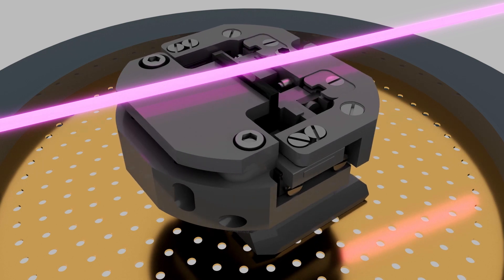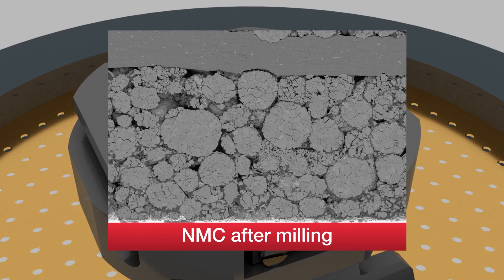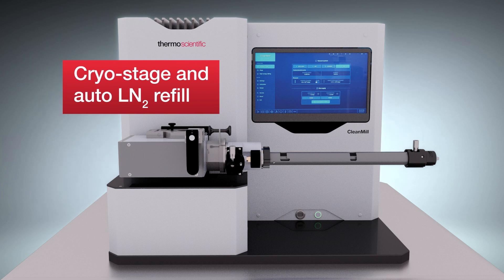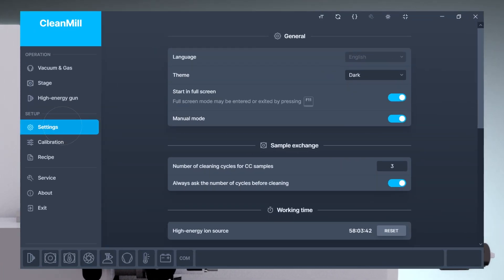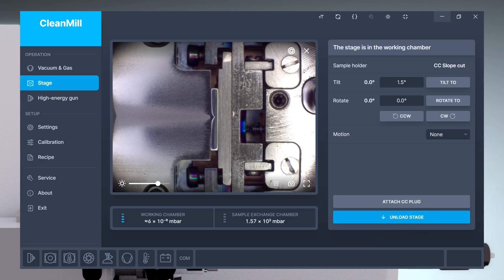The ion range is enhanced by stage automation, mitigating milling artifacts and ensuring consistent flat surfaces regardless of sample type. The optional cryo stage provides our unique auto refilling liquid nitrogen cooling, making it possible to work with extremely beam sensitive materials. Additionally, the integrated touchscreen and high resolution camera helps you easily track milling progress.